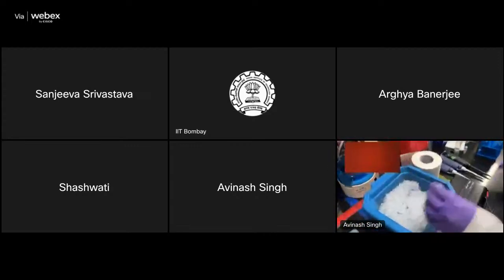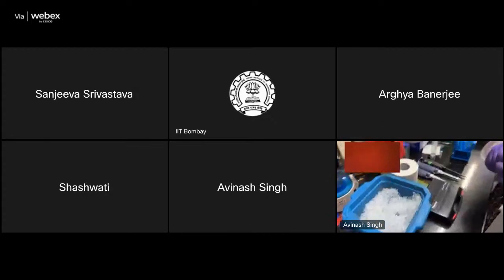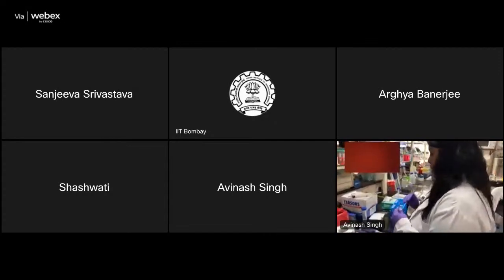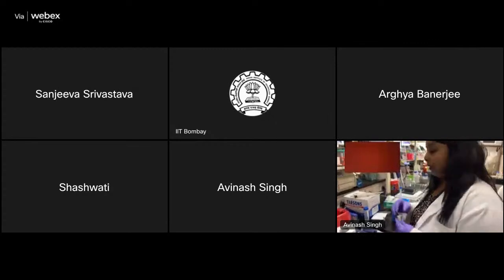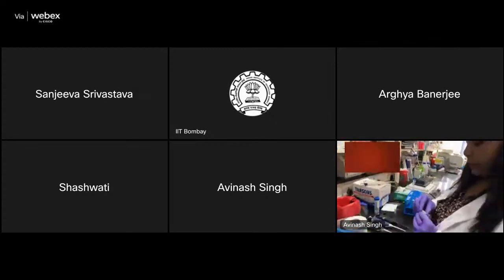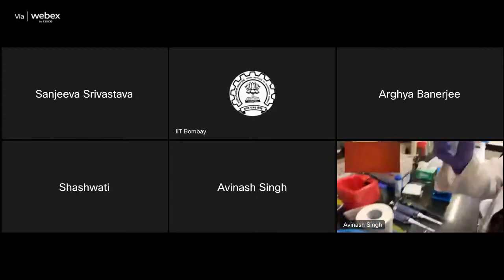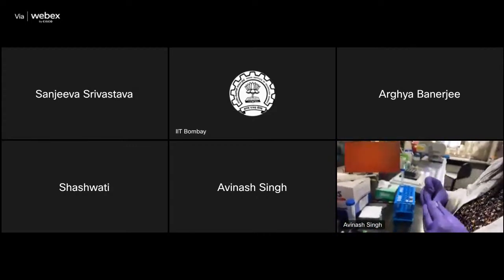While preparing the protein, we have to make sure that all the disulfide bonds are properly reduced in the protein, so that the trypsin has access to the site. So the first step of digestion, we take the sample. So this is the sample. We always try to keep it on ice. We have measured the protein concentration, and according to that, we have prepared the reaction volume.